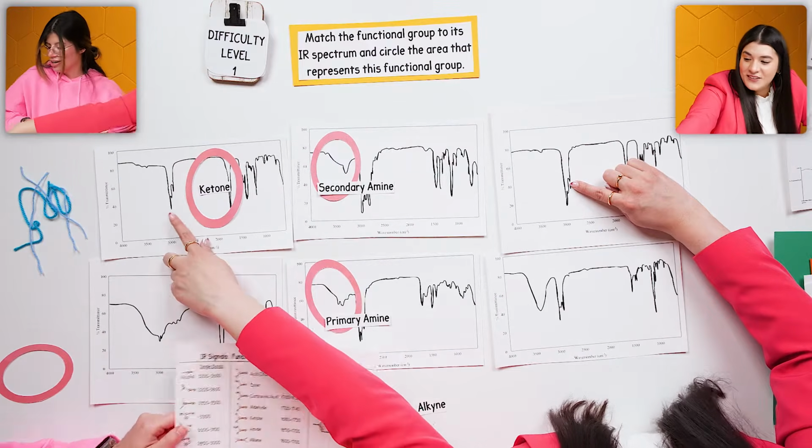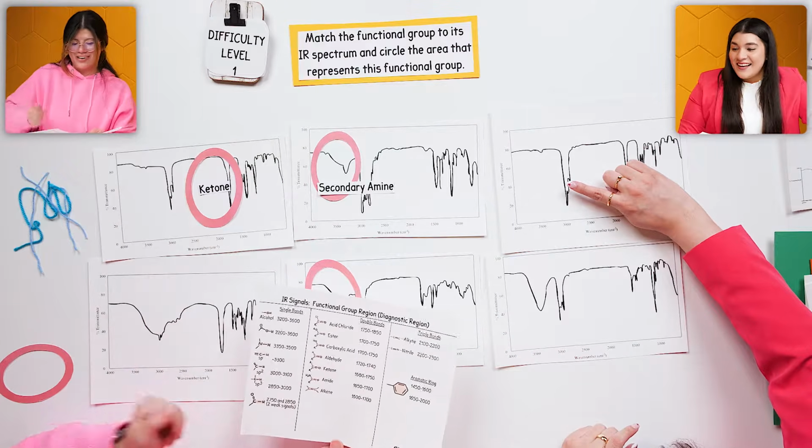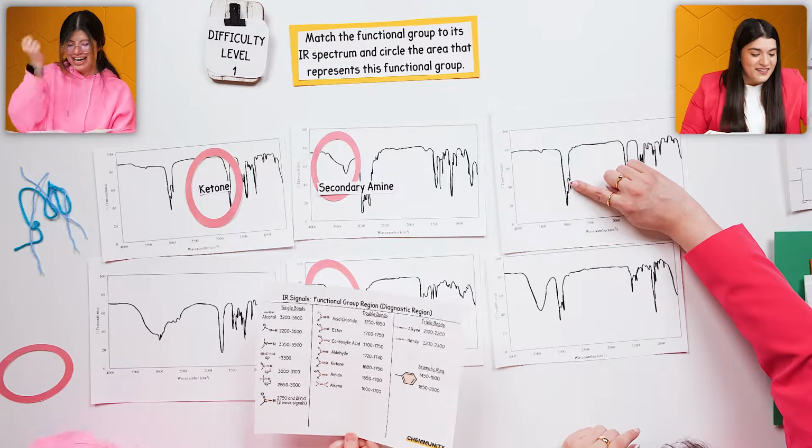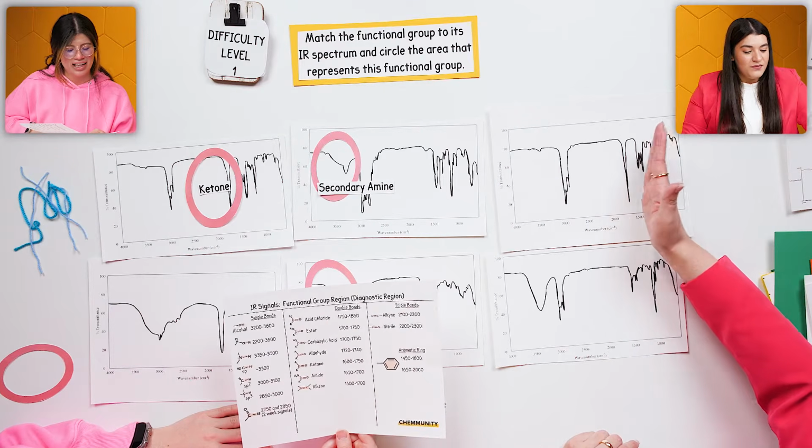So let's go back to the ketone. 3,000 range. What was this? Oh, I see. Yes, you're right. Oh, yeah, we are. It literally is the same. It's just telling me it's sp3 hybridized. That's just an R group. Now I can again look at that strong one.